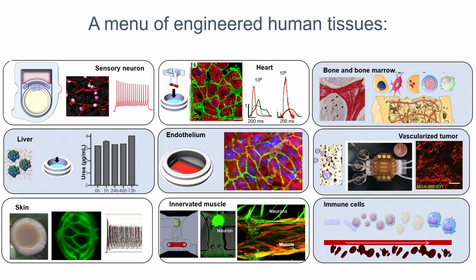So you can make a muscle, you can make bone, you can expand this bone to include bone marrow, you can study barrier functions of endothelium and epithelium, etc. And you can also make some additional supporting cells such as immune cells. Today we are able to derive many types of immune cells also starting from iPS. So, patient specificity and the broad diversity of the tissue types that we can make.